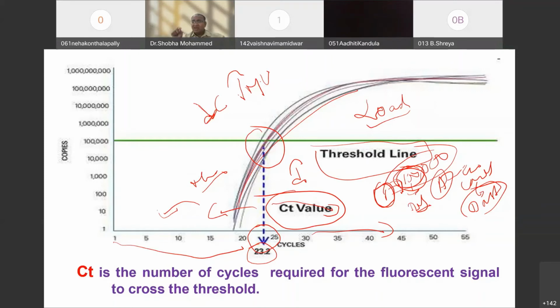Especially whenever there is a virus load, when I'm thinking that. So when I use the drugs, for example, the drugs for hepatitis B, which act on the liver, the virus load, whether it is decreasing or not, the prognostic part when I want to know, this type of experiment helps us to know whether the load of that particular virus is decreased or not.